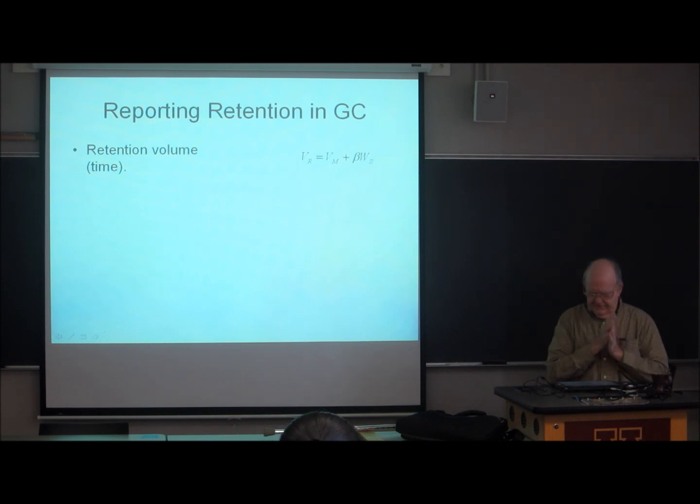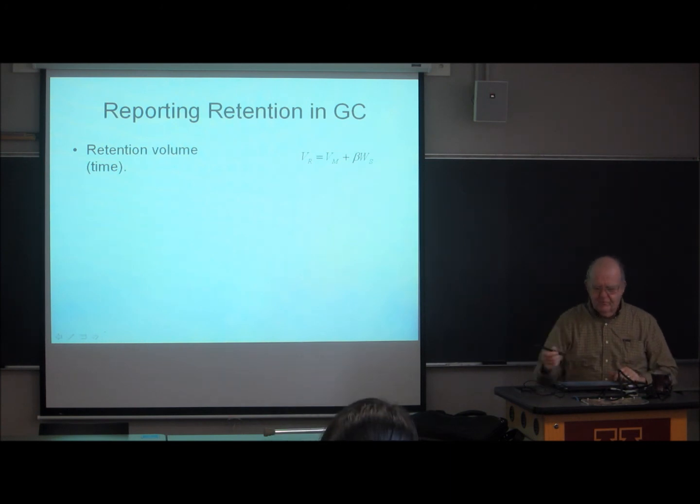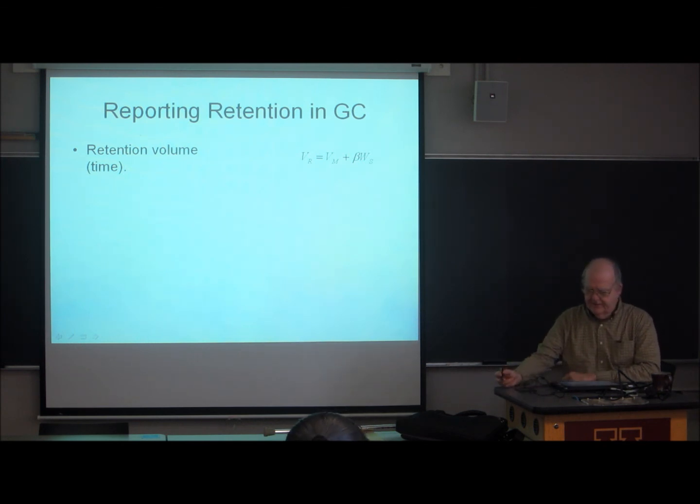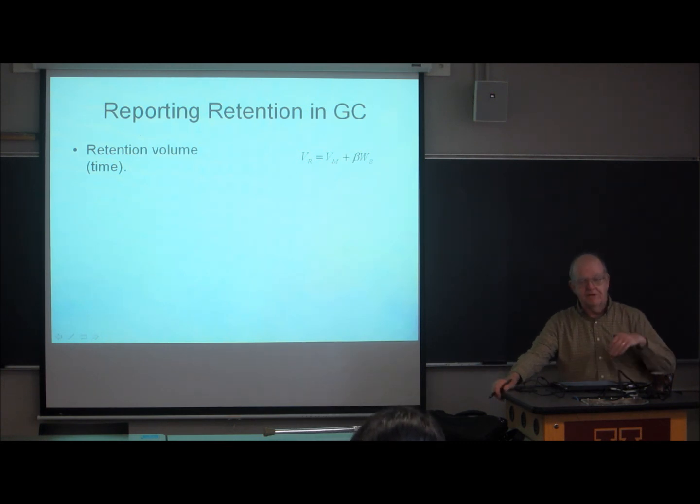Okay, so that's sort of the end of the practical stuff for now. Well, reporting retention is also a practical issue. And it turns out that gas chromatography is much more complicated than liquid chromatography in terms of how we have to report retention. And I'll get into the reasons why that is so later.